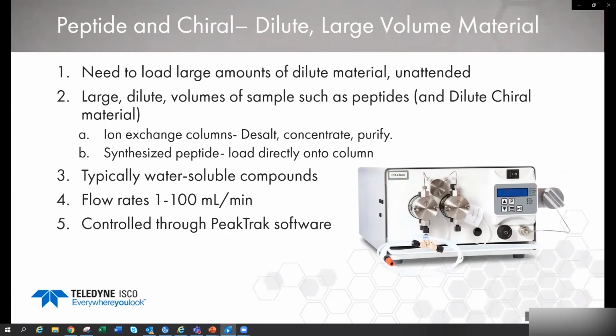The problem with loading large amounts of material is, as in the chromatograms I showed you earlier, if your compound has some methanol or other solvents in it, you can potentially get breakthrough and bleeding through your system. So what we typically try to do is find a way to adhere the compound to the head of the column. That was the first thing I mentioned earlier, where we want to make sure that the compound focuses.